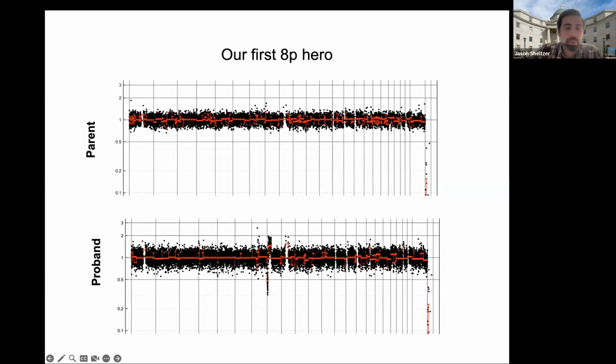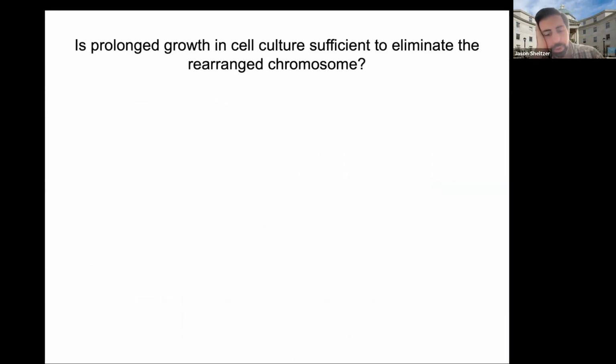And when we thought about how we wanted to do this, the approach we wanted to take is to start with the least invasive approaches. That is, we wanted to use the gentlest manipulations to these cells that we could do first in order to minimize the possibility that we were causing some other cellular change other than what we wanted. And really the most basic, least invasive approach that we could think of is just growing these cells in Petri dishes for a prolonged period of time.